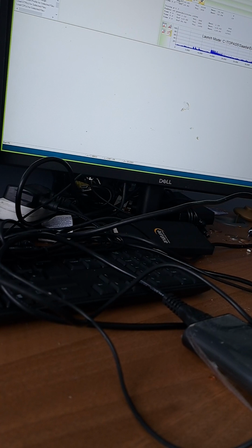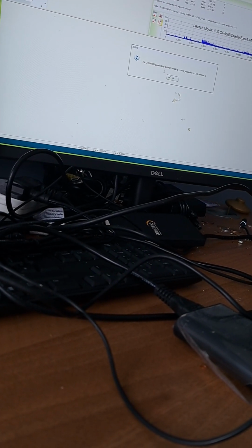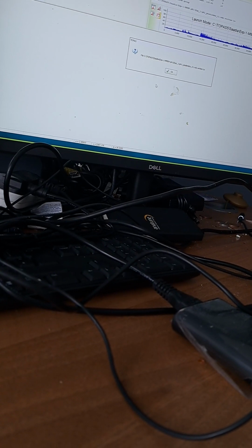No range to fit, okay. Okay, so we're getting slightly better now. We're up to 100. Okay, that's promising. So let's maybe look at that then. So if you open up that NDX file then in Topaz. Okay.